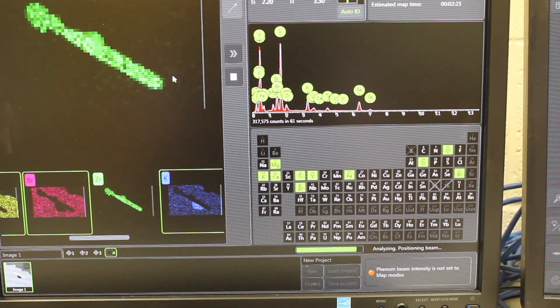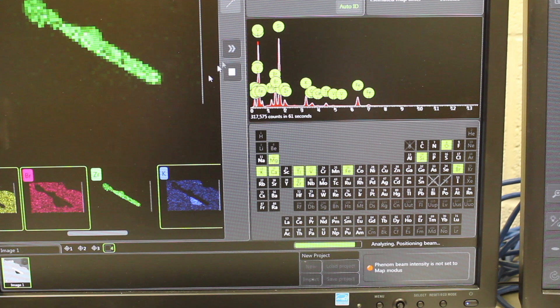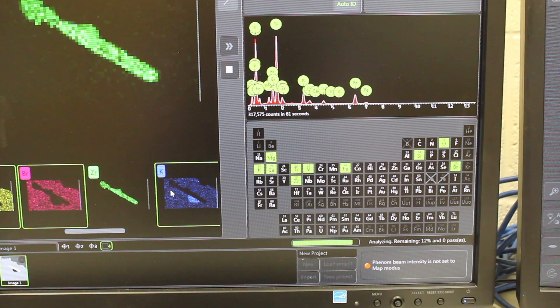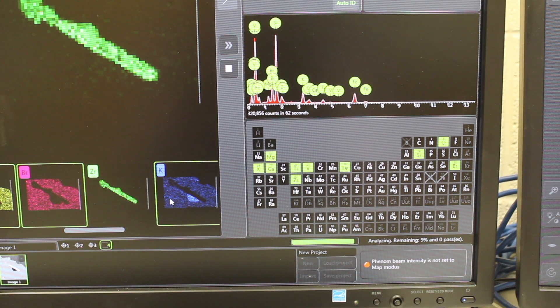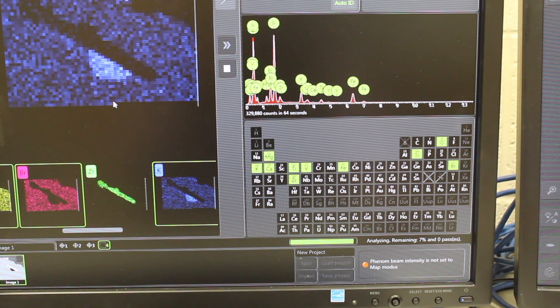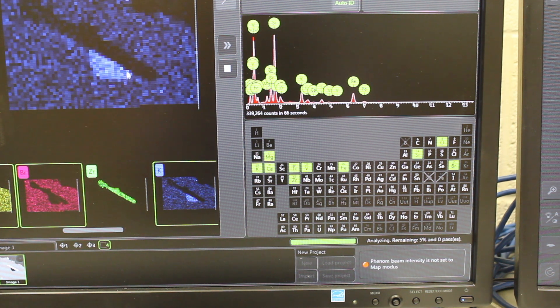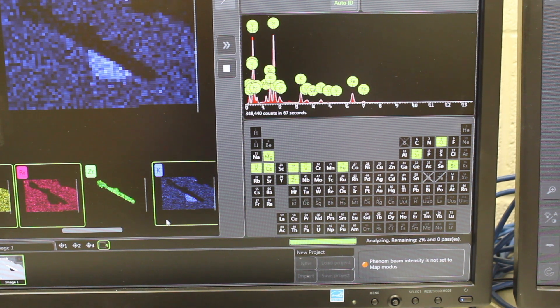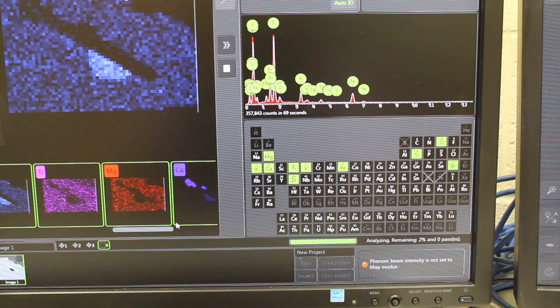So these are pretty neat, and you can kind of pick and choose what looks important for your sample to plot. Here's some potassium-rich area in this area below the zircon, for example.